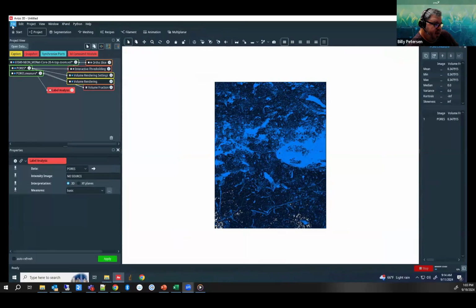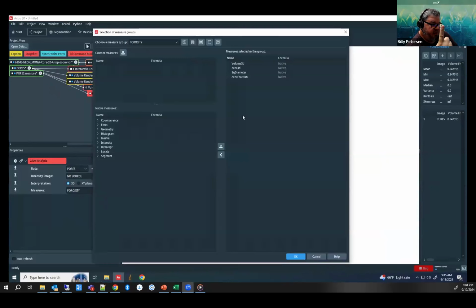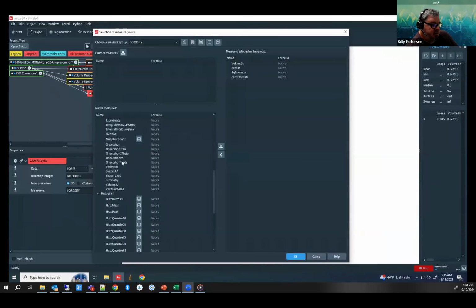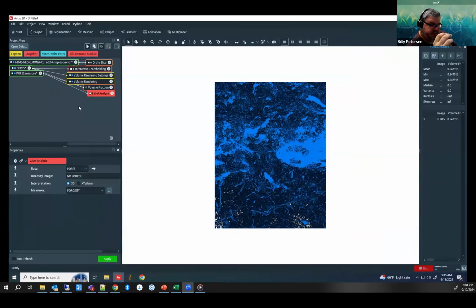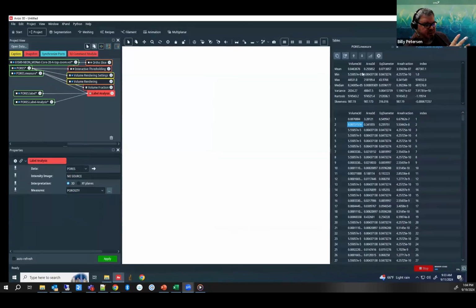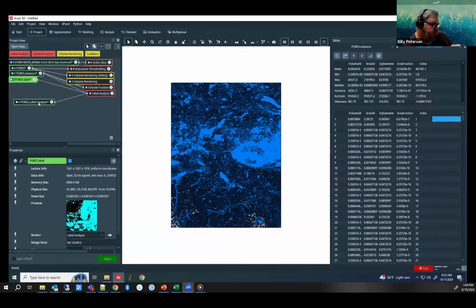All right, this is where we analyze the pores. This part right here is a preset we do for porosity. Under these presets, you'll see it's volume, area, equal diameter, and area fraction. There are a lot of different things we can add to this. We can do different types of geometry, shapes, everything. And if you're not dealing with a binary image, you've got a lot more to deal with. But afterwards, and that would have taken 5 minutes, by the way, you get this. Lots of data, individual pores.